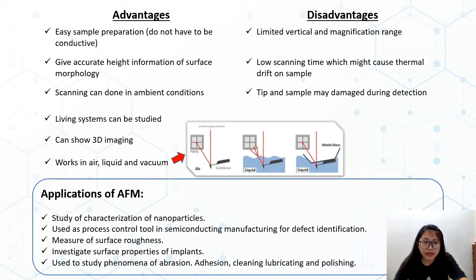Some of the applications of AFM are the study and characterization of nanoparticles. AFM can also be used as a process control tool in semiconductor manufacturing for defect identification.